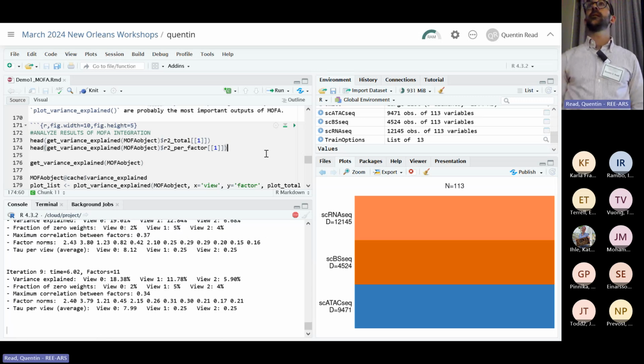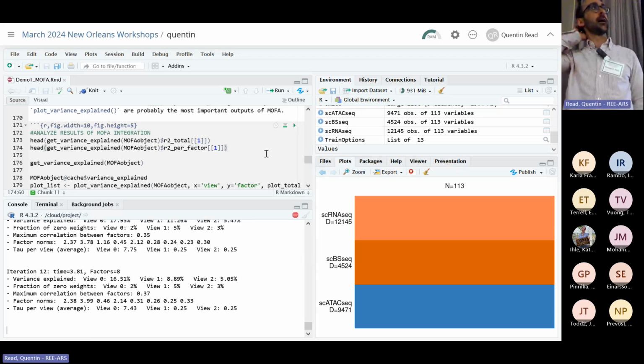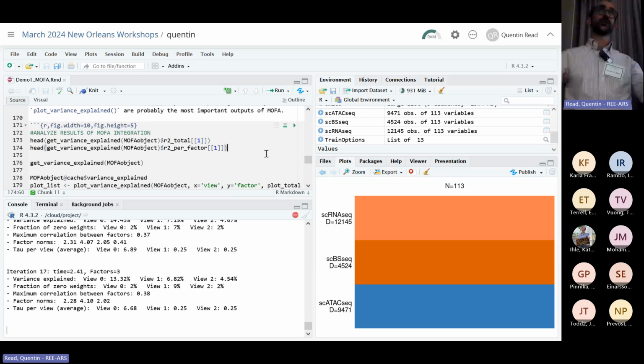Yes, Greg. Could you use like 2 time points as like the 2 omics? Just kind of look for like an interaction. Like say you had RNA-seq from. Yes, I think you could do that. You're integrating information from multiple omics. There's no reason why it has to be qualitatively different ones. I think you certainly could do it for different time points, and that would be a great idea. And it should, because it's sort of tracking individuals across them, it would account for the fact that they come from the same individual. I mean, just off the top of my head, I don't see why not, and it seems like that would be a good idea.